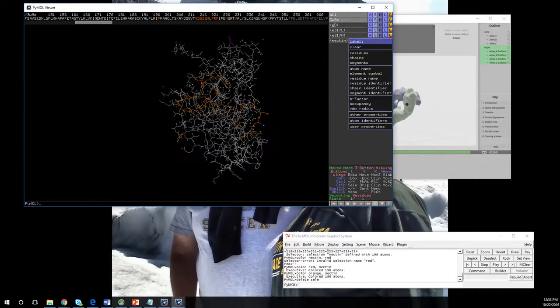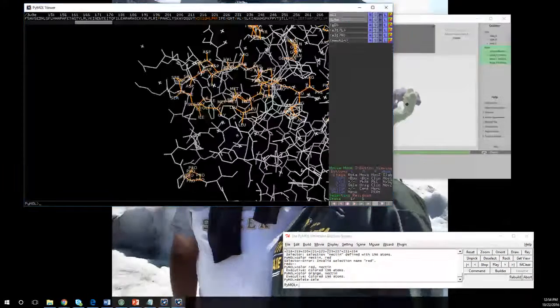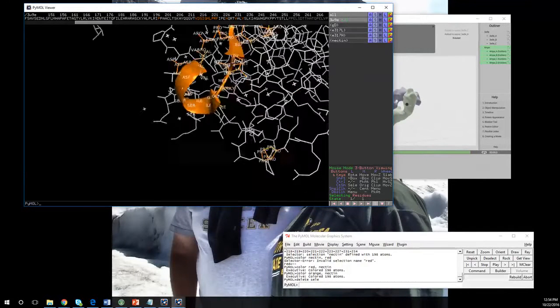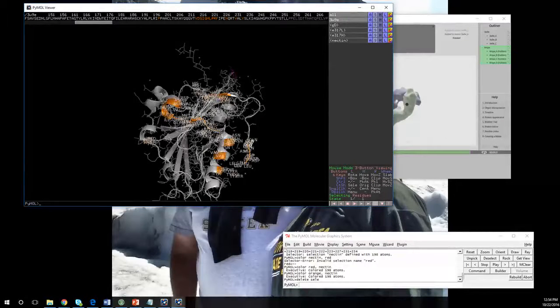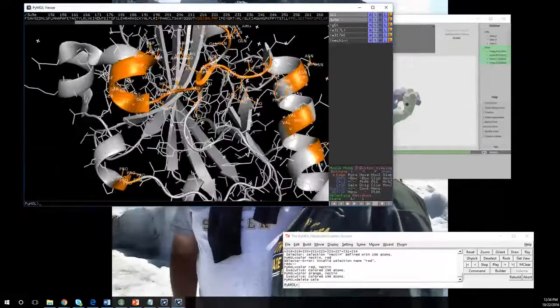And if you look at the nectin, you can label the nectin right here by the residue name. Now I'm right clicking and dragging, and you can see that all of the residues are labeled. I can also go in here and show as a cartoon, so I can see the secondary structure of the nectin binding domain. If I want to look at the whole thing as a cartoon, now I can, and if I zoom in, I can really effectively see what's going on.